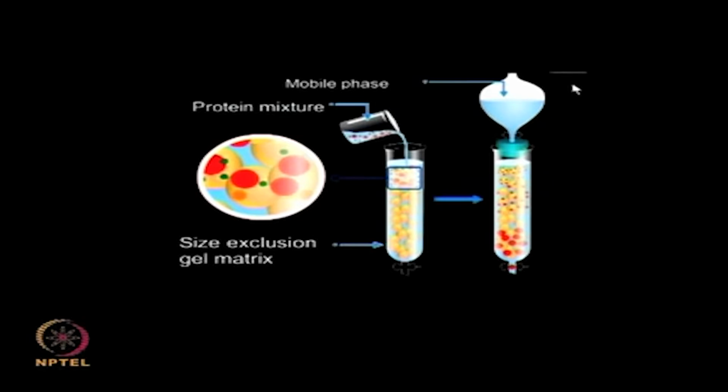Solvents or buffer systems are often used in other types of chromatography. Effluent sample fractions. The solution leaving the column is collected in suitably sized fractions. Initial fractions will contain only the mobile phase, while later fractions will have purified proteins.